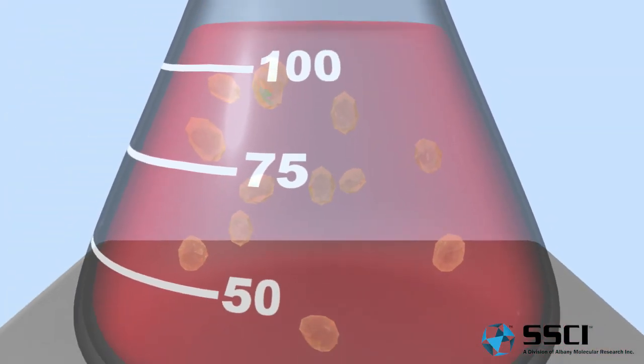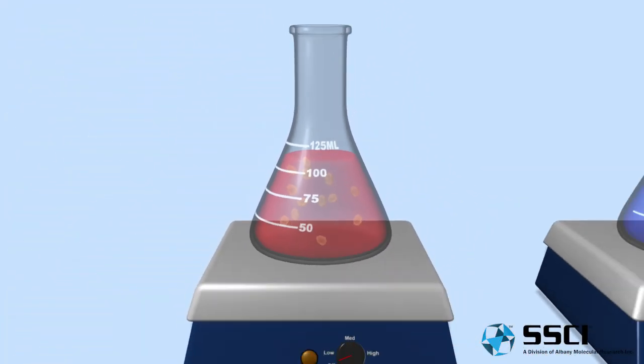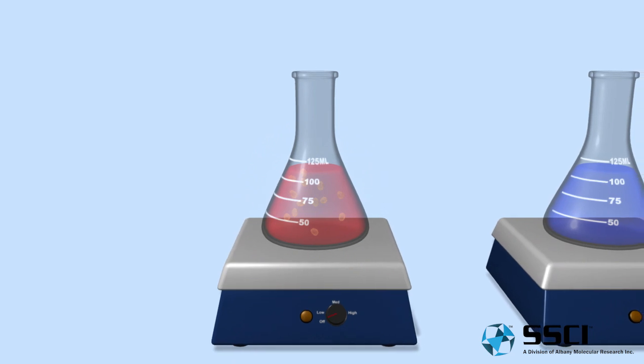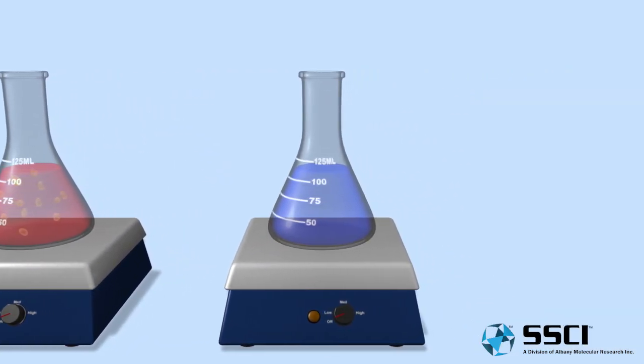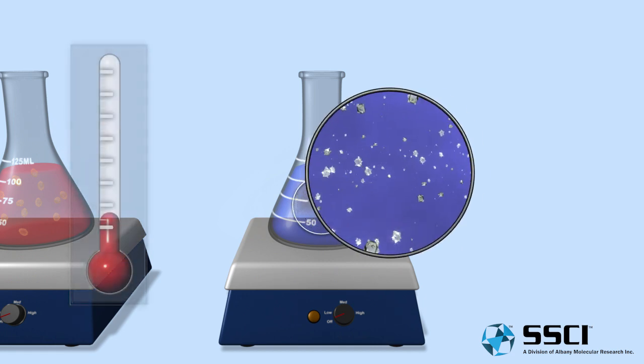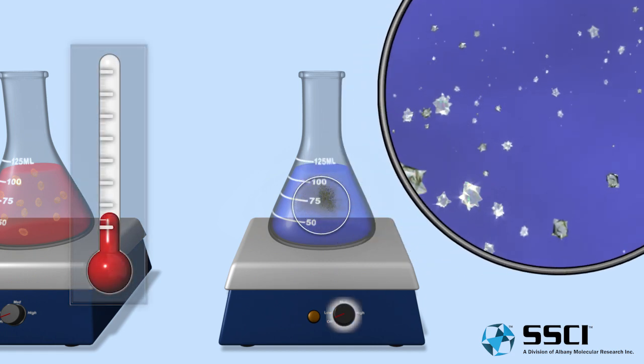Next, let's consider a different solvent system, a slightly different concentration of acetaminophen, or perhaps a different temperature profile as a means to crystallize a different polymorph. Again, the solid is added to the solvent and the system is heated until the solid is completely dissolved.